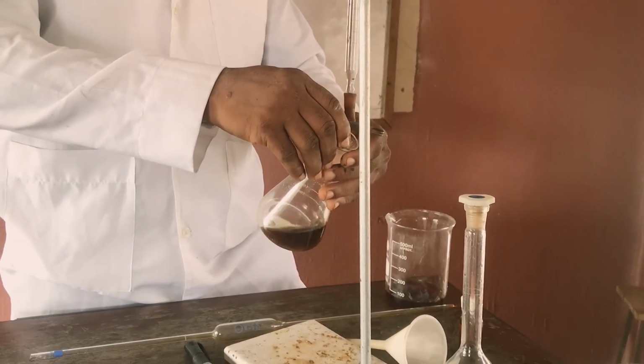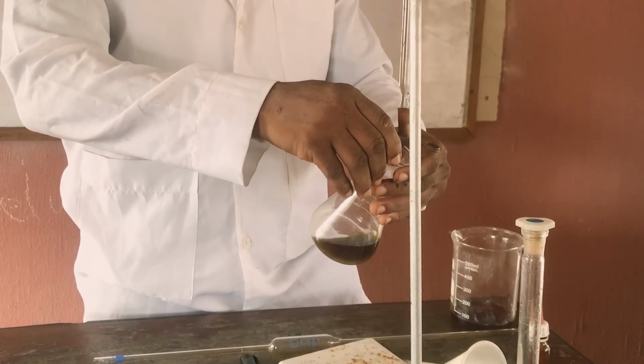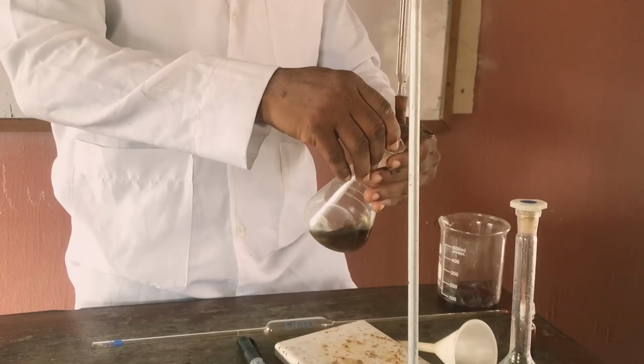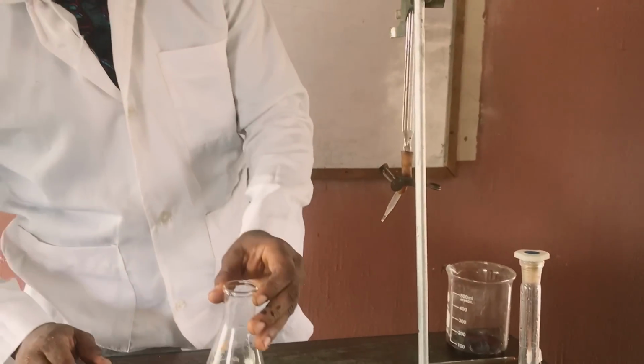Gently, please, gently. Can you see that? Okay.